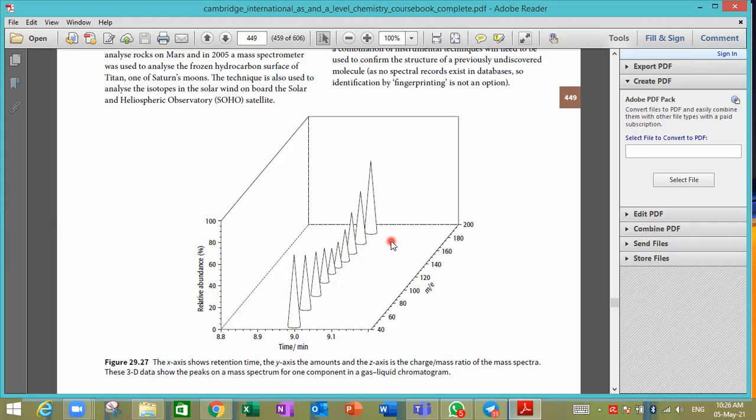The last peak that we get in the mass spectrum gives us the molecular ion peak, from which we can calculate the molecular mass of the compound. And from the different fragments, we are sure that our compound has this molecular formula, or this structure, I mean.